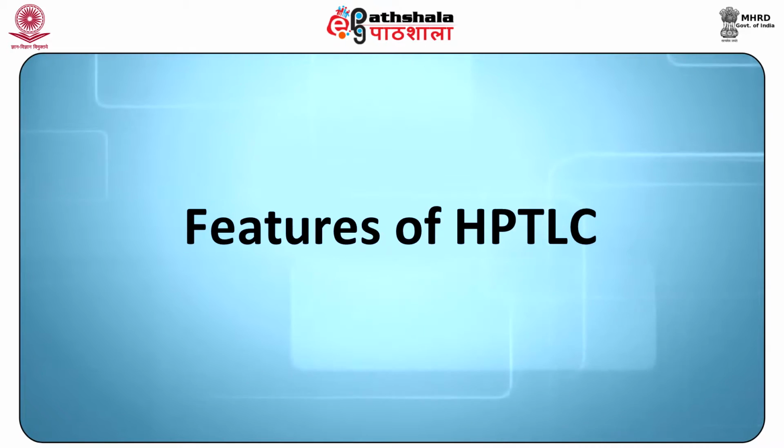Features of HPTLC. Technically, it is easy to become skilled at and operate, several analysts can work simultaneously on the system, and there is availability of a wide range of stationary phases with selectivity for mixture components.